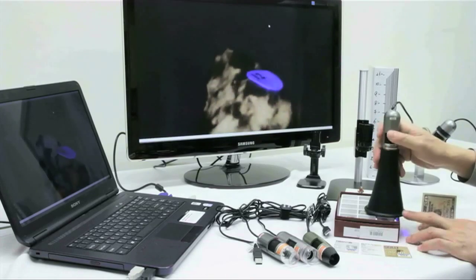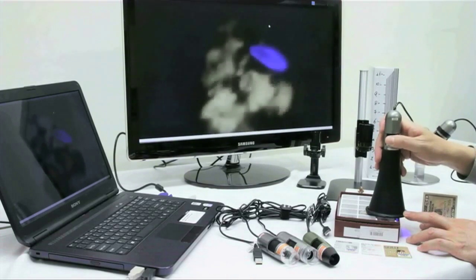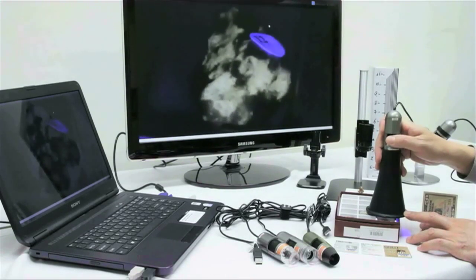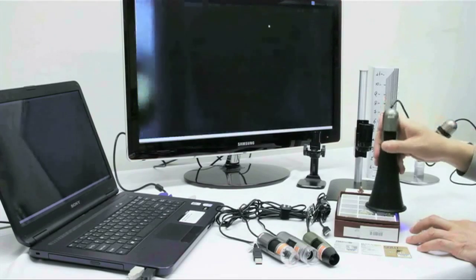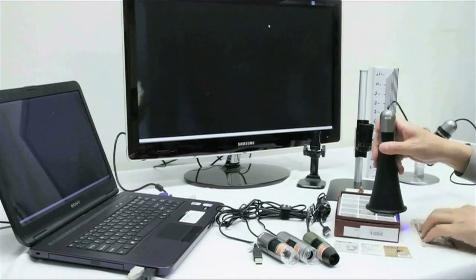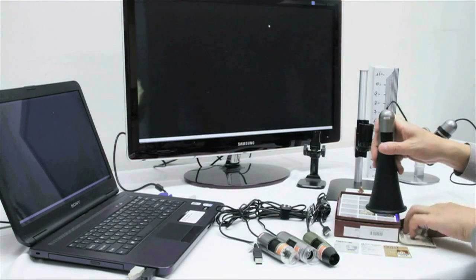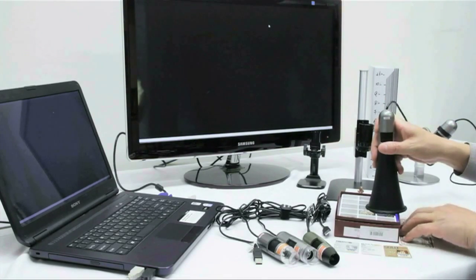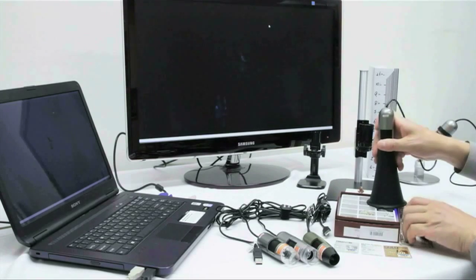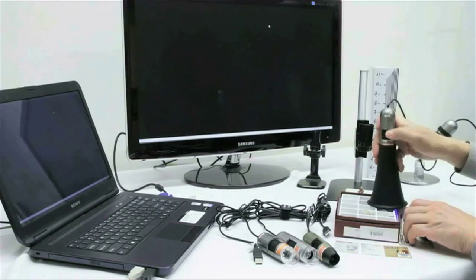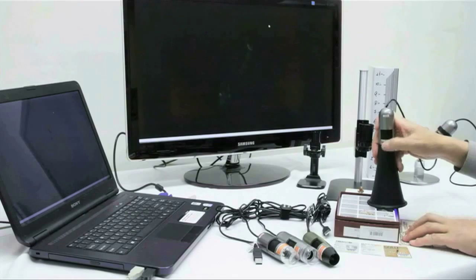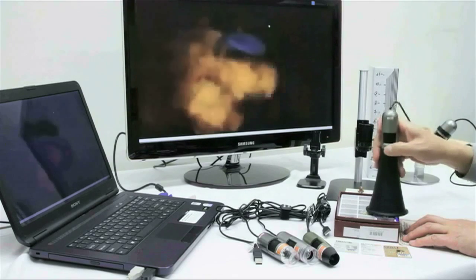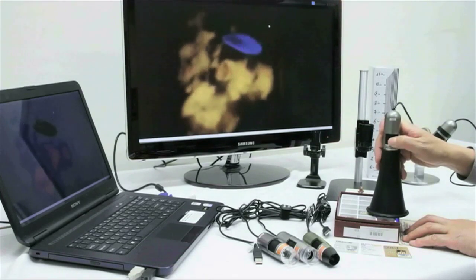Now we can move over to some organic materials like rocks and stones and different organisms, chemicals and sediments that have been embedded in this rock that will fluoresce under UV light. This comes in handy when you are trying to detect different substances on any organic material.